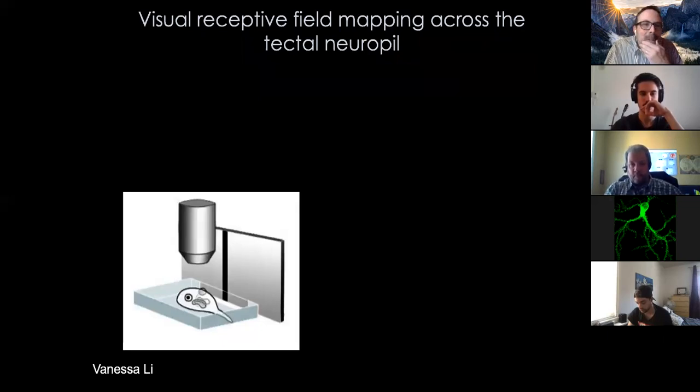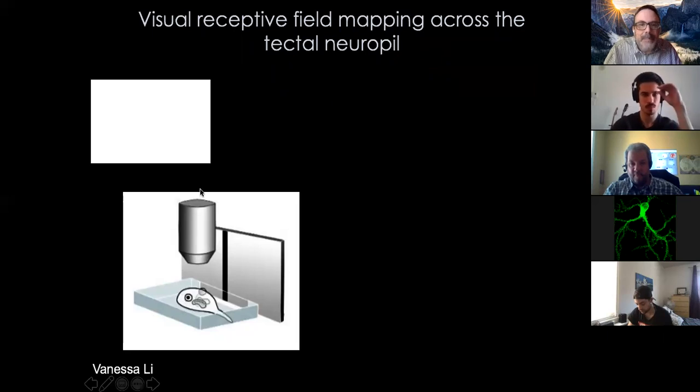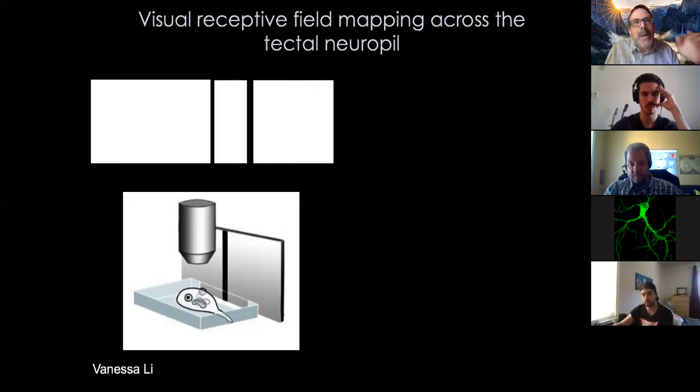Okay, so for my lab, we're interested in studying the emergence and development of topographic maps. So the approach that we've used is to take advantage of our ability to express GCaMP in these different compartments, present visual stimuli to the animals on a video monitor while the animal's sitting under the two-photon microscope embedded in agarose. We can either do reverse correlation type stimuli where we flash a bar at different locations in the visual field, or more often what we do is we sweep bars. I don't know how well the videos come through on Zoom, but it's just a bar sweeping across the visual field.